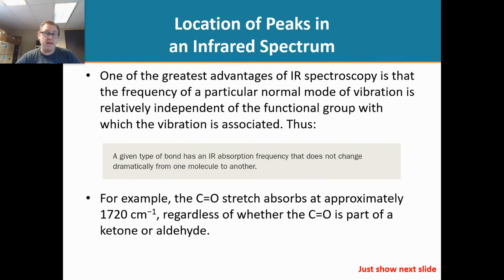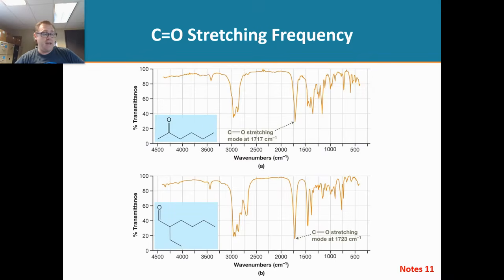Now this slide right here presents some information that's very important, but just reading it to you is not the most effective way of teaching it. So this is kind of just for your study notes. Everything on this slide I'm going to discuss here. And one cool feature about IR spectroscopy is the fact that functional groups, like a ketone right here.